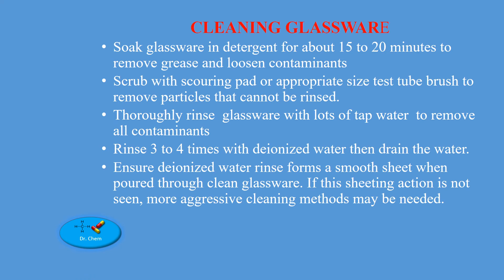Cleaning glassware: soak glassware in detergent for about 15-20 minutes to remove grease and loosen contaminants. Scrub with a scouring pad or appropriately sized steel brush to remove particles that cannot be rinsed. Thoroughly rinse glassware with lots of tap water to remove all contaminants. Rinse 3-4 times with deionized water then drain. Ensure the deionized water rinse forms a smooth sheet when pouring through the clean glassware. If this sheeting action is not seen, more aggressive cleaning methods may be needed.